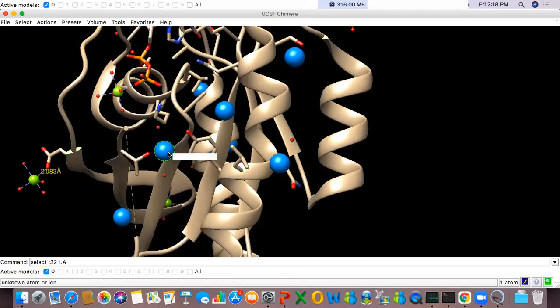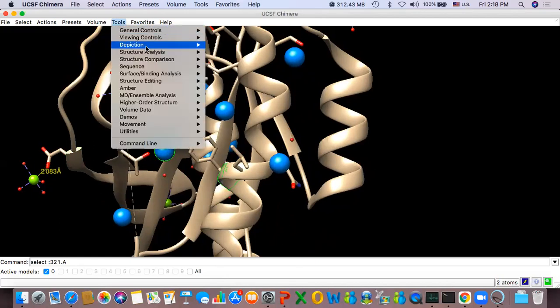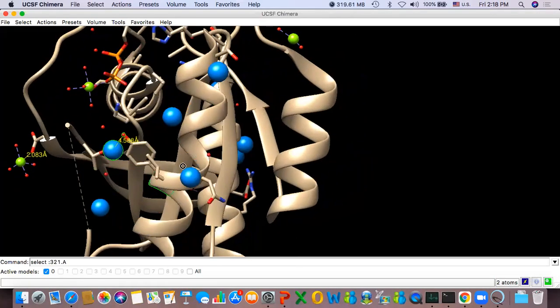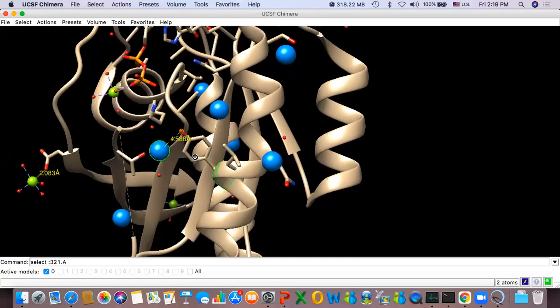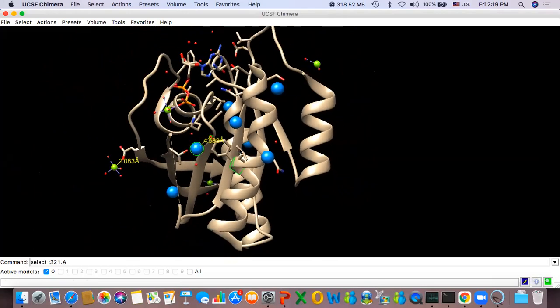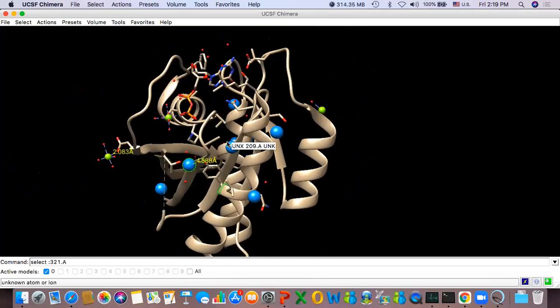So I'll click this and the OH of this, and let's look at the distance: structure analysis, distances. Great. So this is barely 4.5, 4.58 angstrom. This is the distance between them, and based on the 4.5 angstrom cutoff, we'll say, well, this is not interacting. So cutoffs are very harsh. That means 4.588 is also not accepted as an interacting atom for this particular ligand, the blue color ligand. Okay, so this is how you determine whether a particular ligand is interacting with a protein or whether the two proteins are interacting or not.